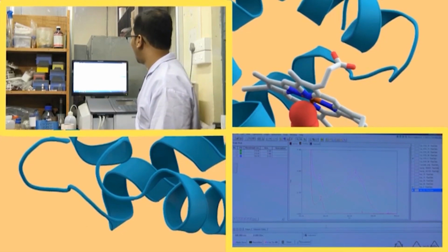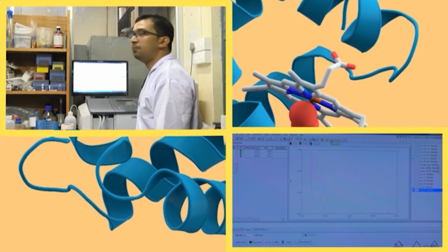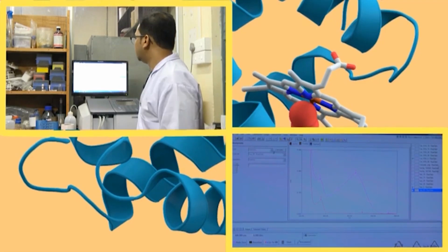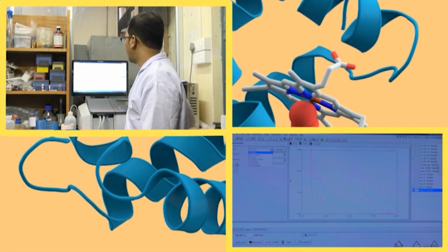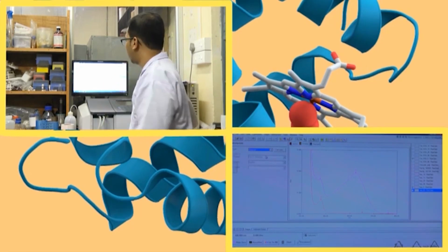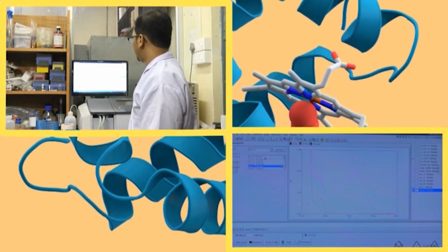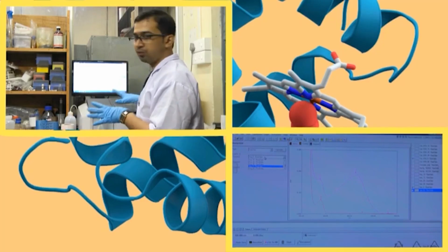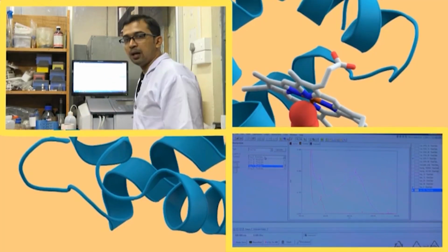So, how to subtract? Here is an icon known as manipulate. The manipulate icon gives an option for subtraction. The type, here we will select data set, the data we will take from here, and the operation we will select as subtraction. This is a facility this instrument gives. Other instruments might have some more advanced facilities also.